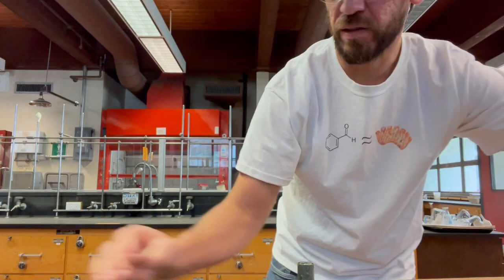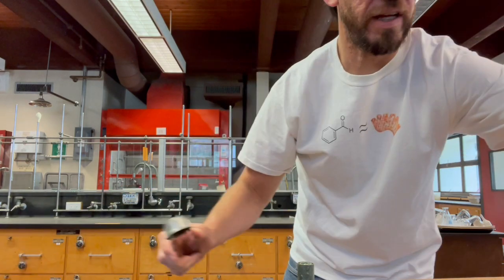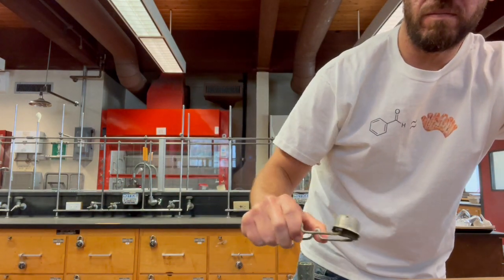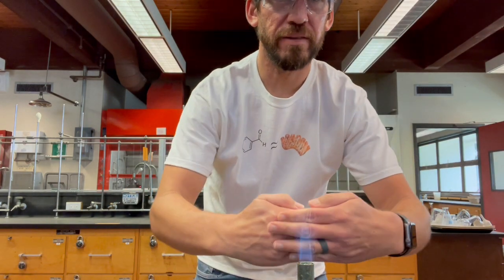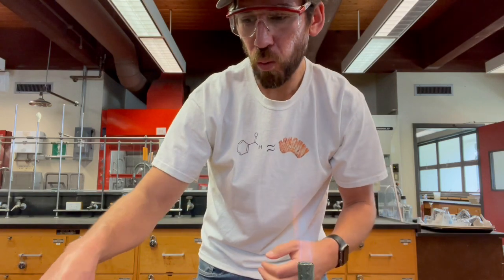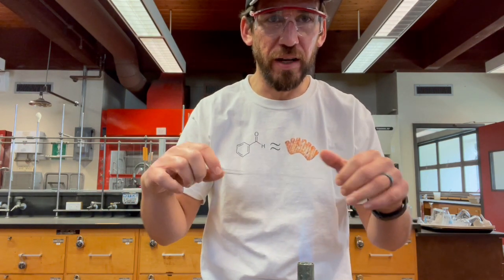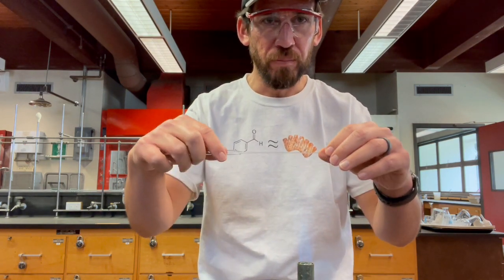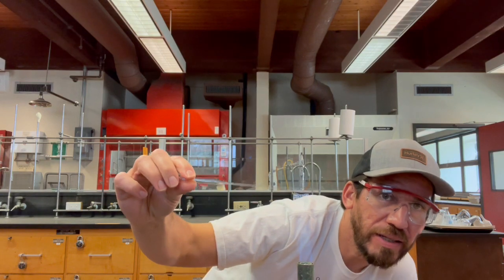Oh, too much oxygen, or too much gas. There we go, look at that. See that blue flame? Check it out. Man, I wish I wore the black shirt. You can see the glass is what I mean. But here's what I want to do. Keep an eye on the glass, okay?